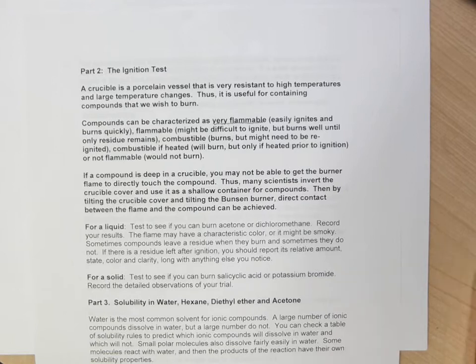until maybe a small amount of residue remains. It might be only combustible, meaning you could burn it under certain circumstances, but it doesn't readily burn. You need to try to set it on fire, it lights up, but then it smolders out and you need to reignite it to get it to burn.